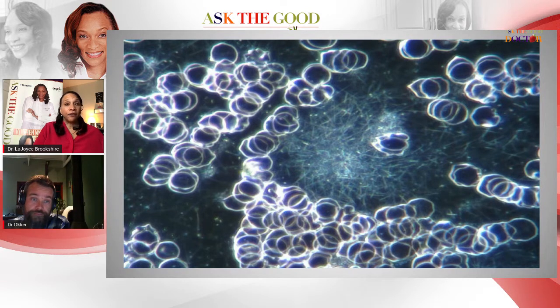All right. And what kind of trouble is this person into or headed for if they don't make a change? So most of these anomalies relate to imbalances that natural health practitioners work with. So we work with nutritional deficiencies, and, you know, the pH and the gut and the digestive system and the liver and the organs of elimination and so on. So all of those indicators we can actually very clearly see in a live blood sample. And as you know, all these imbalances can lead to the development of chronic disease.